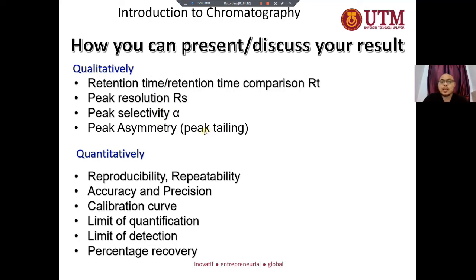I believe you all already know. The retention time, the peak resolution between peaks, and also the peak selectivity, the alpha. If you have a tailing peak or a fronting peak, you need to describe it.